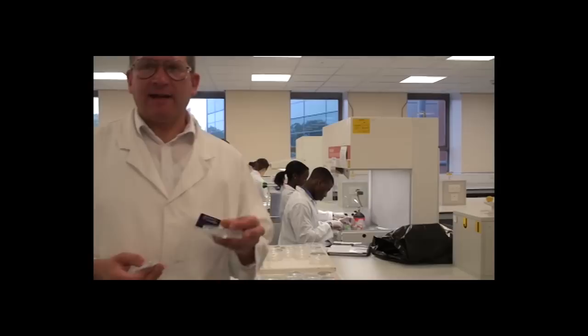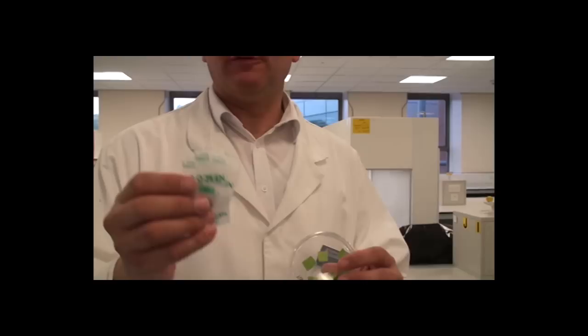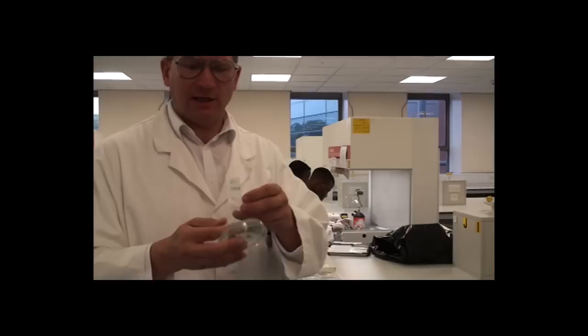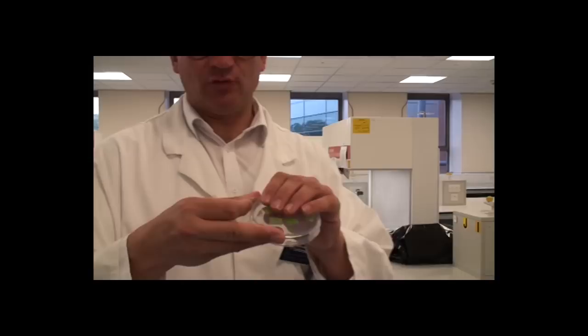After we've completed the tissue culture, we then have to seal the plates, and we do that with this parafilm, NESCO film. We take a piece of that and put it onto the side of the plate, and then stretch it round in order to give a good seal so that the tissue doesn't dry out and remains sterile.